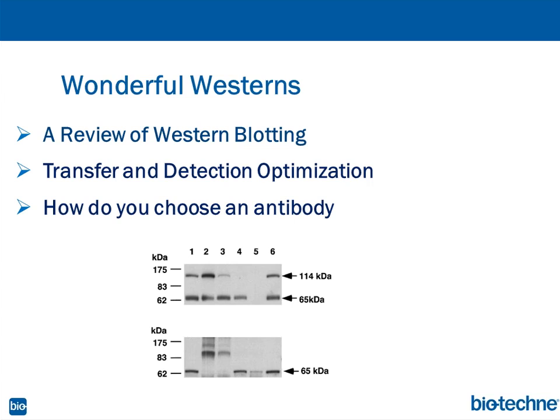There's also another group that doesn't get as much press, but it's the number one workhorse of protein research. And with all the sophisticated technology out there, most people are doing Westerns.